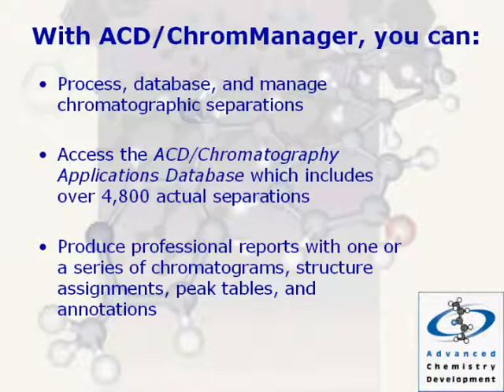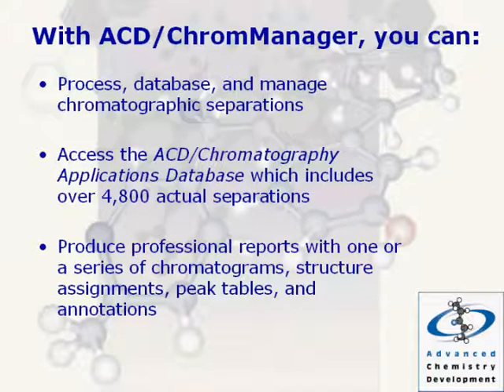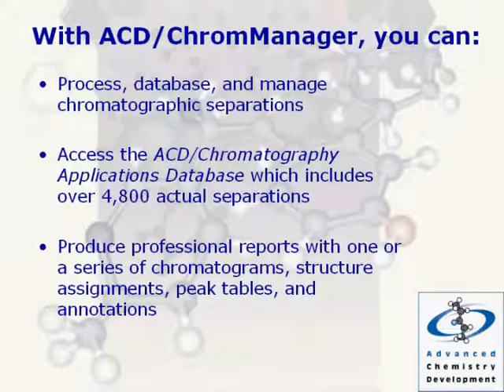Produce professional reports with one or a series of chromatograms, structure assignments, peak tables, and annotations.